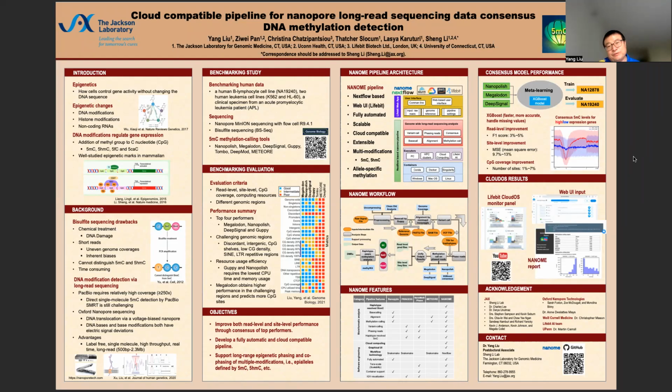Studies show that more than 50% of human cancers have mutations in genes that encode regulators of the epigenome. A lot of technologies have been developed to quantify DNA methylation, and bisulfite sequencing is the gold standard technology for DNA methylation. In bisulfite sequencing, the chemical conversion will only convert unmethylated C to T, leaving methylated C as it is. Bisulfite sequencing is the most widely available and standardized technology for qualitative and quantitative efficient detection of 5mC.